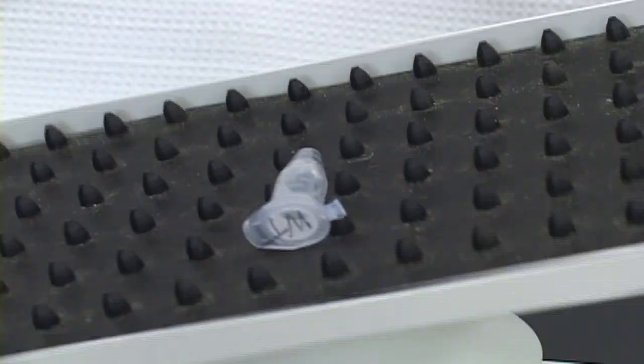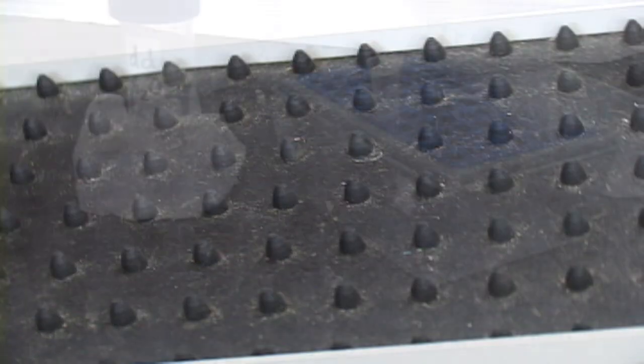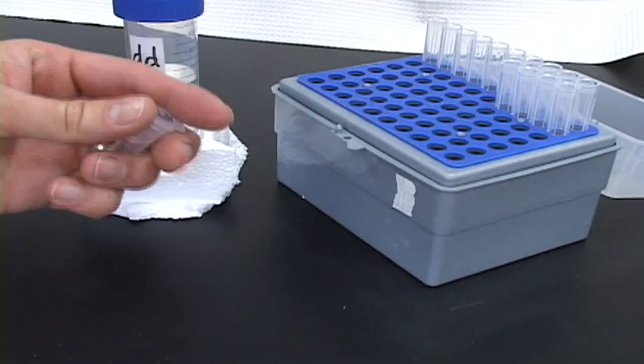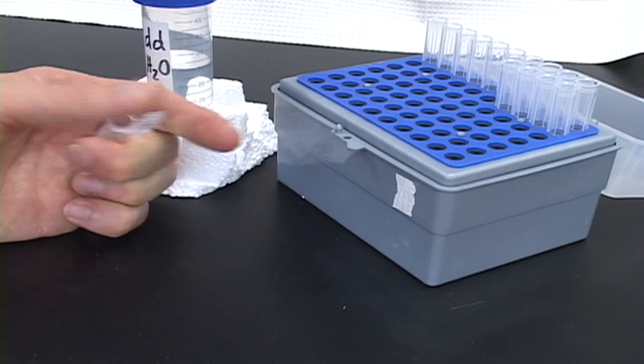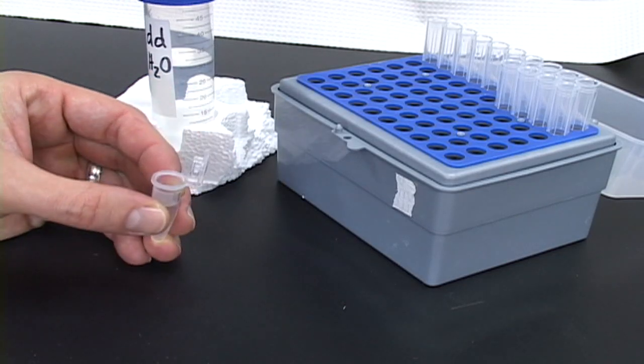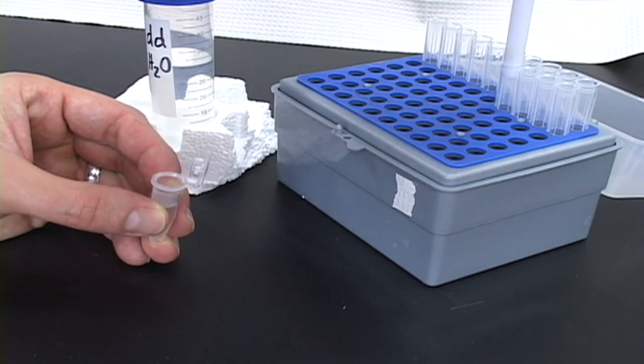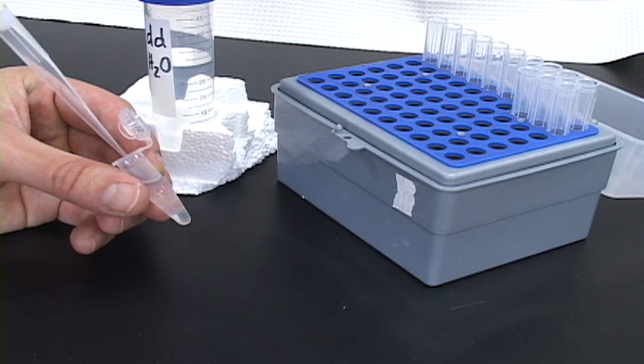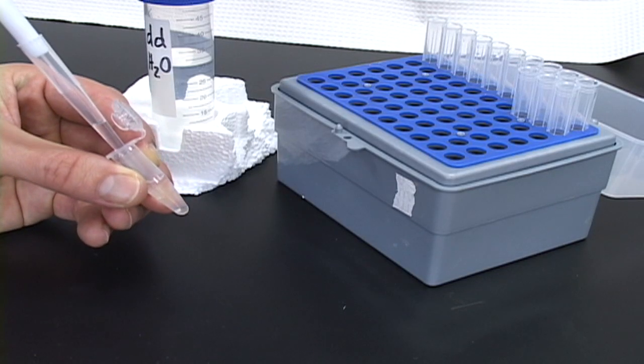After washing, the seeds must be rinsed several times to remove any traces of the bleach. This is done by rinsing with four volumes of sterile water. First, remove the bleach solution from the tube using the same careful method as with the ethanol removal, making sure not to draw up any seeds.